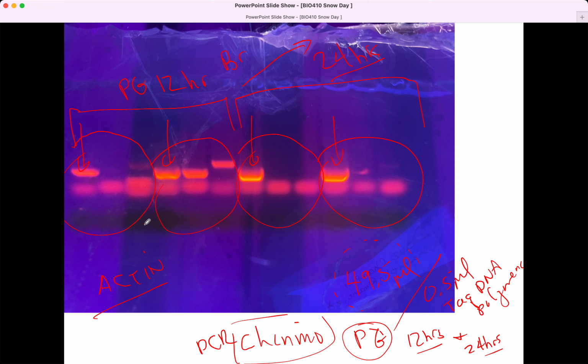I was worried about the first group's samples because when I checked, I saw that the first tube had only about 40 microliters in it, and the third tube only had about 30 microliters in it. I was really concerned that they were not going to work, just based on the volume. All these other tubes had really similar volumes, very close to the expected volume. So even before the PCR reactions were done, we had concerns about this.